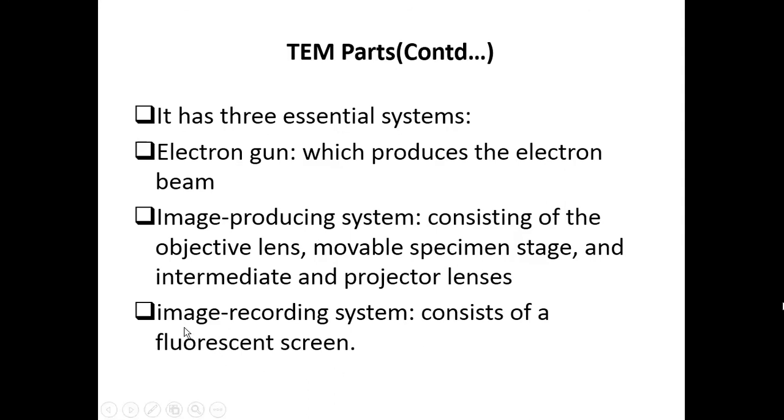Okay. Then an image recording system. What is the recording system here? Here the recording system is the fluorescent screen, that is the CRT screen. It is very similar to your computer screen, because it is really a computer screen only.